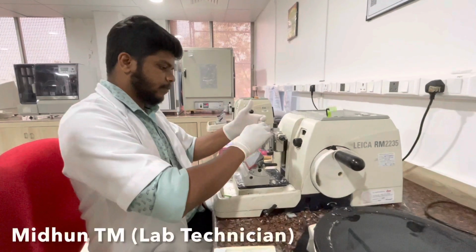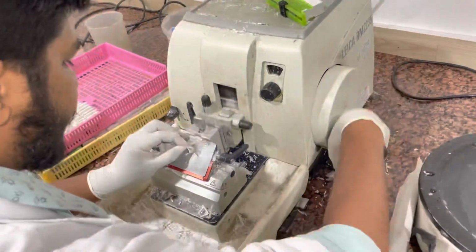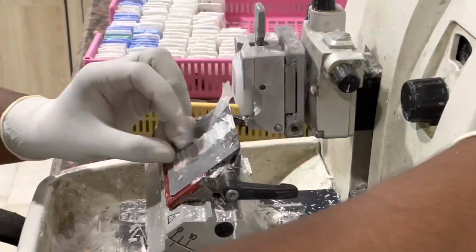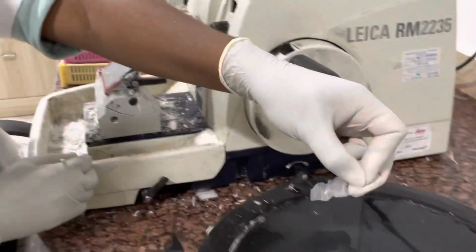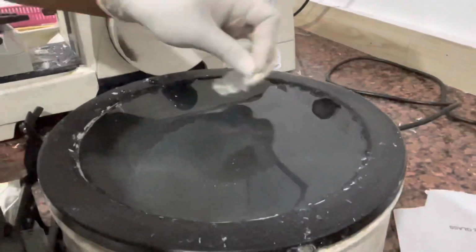The next step is section cutting using a microtome. The section should ideally be 2 to 4 microns. In Amrita, the section is 3 microns in size. The types of microtomes are rotatory, sliding, and rocking. As you can see, the section slide has been put into a flotation bath.